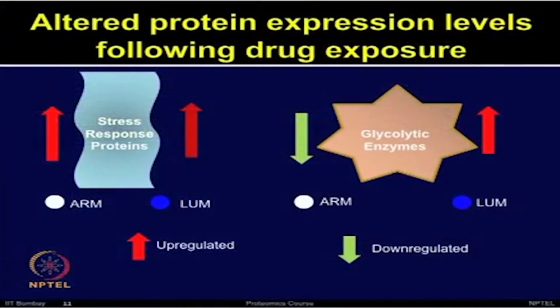The expression of the same enzymes was upregulated more than threefold due to the lumefantrine treatment. However, there are certain proteins such as the stress responsive heat shock proteins, which were commonly induced by either of these drug treatments, which looks like a general stress response as compared to any unique response to the given drugs.